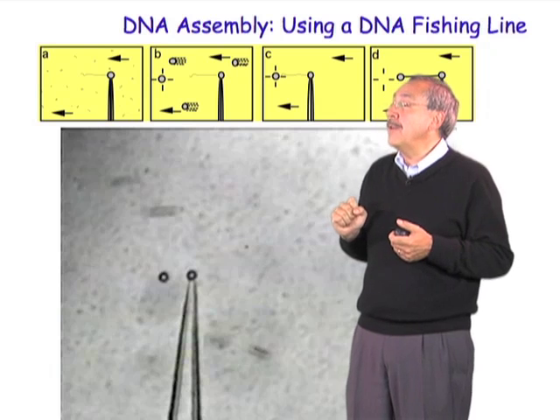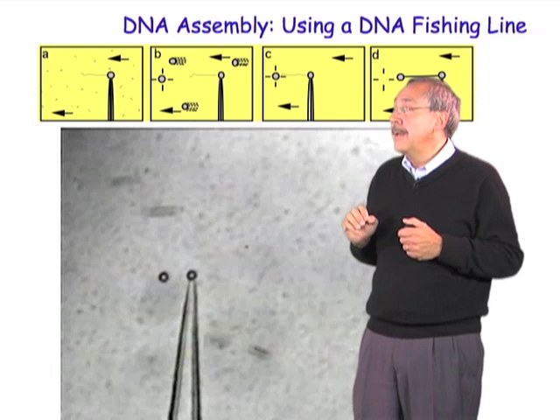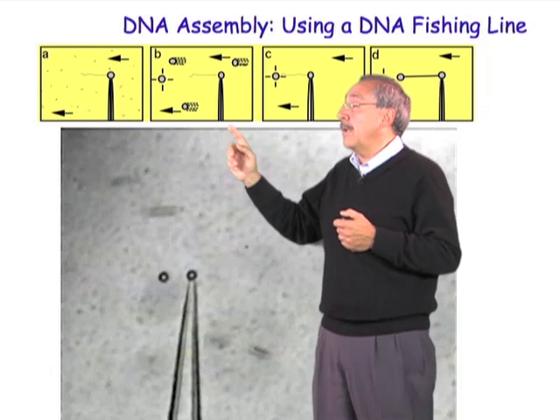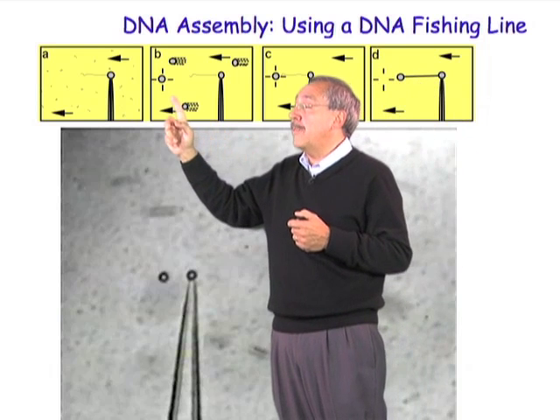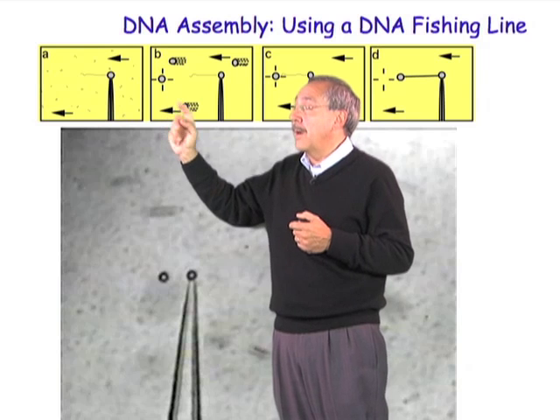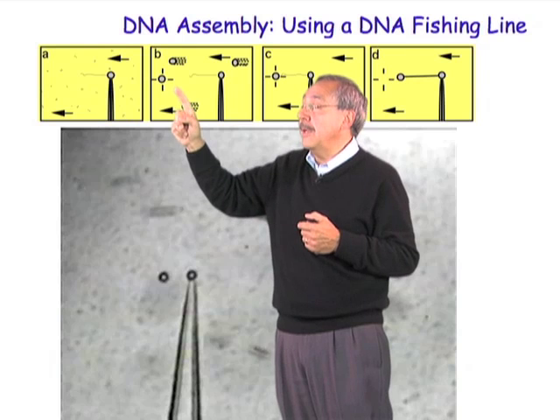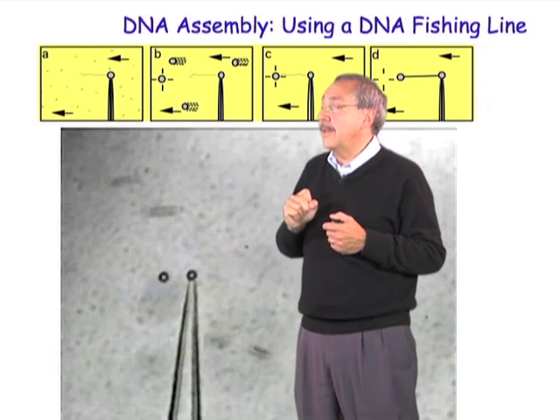Okay, now that you have the molecule hopefully attached, you pass more beads and you turn on the optical trap. The optical trap, or optical tweezers, is indicated here by the four tick marks. One of the beads will pass by the trap and will get trapped in the optical tweezers, in the center there.